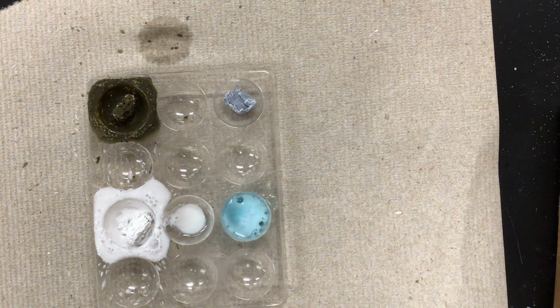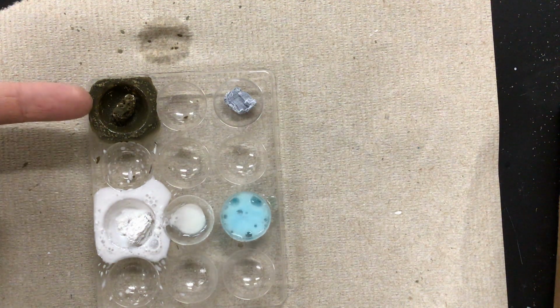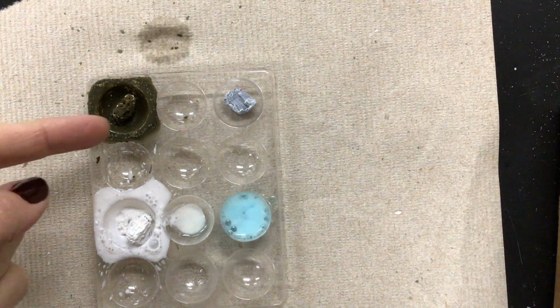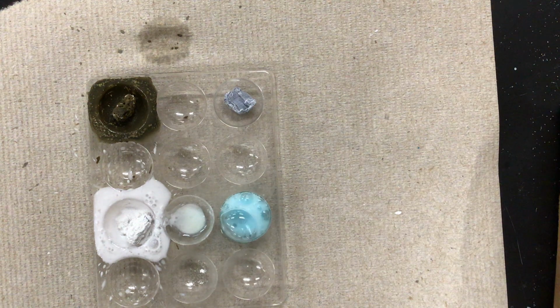It's still producing a gas, so the reaction is still happening. Usually the reaction will continue to happen until either the liquid is completely used up or until the calcium metal is completely used up. So I bet if we were to go back and put more liquid in one of these first two, we would get the same type of violent reaction, because if you notice, there's almost no more liquid in these first two. So the reaction continues to take place until one of the reactants is completely used up.